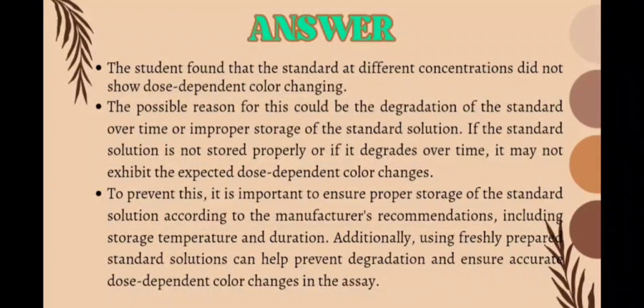So how can we prevent this from happening? Of course, to have proper storage conditions, it is very crucial to adhere to the manufacturer's recommendations for storing the standard solution. This includes the specific storage temperature and of course the duration. And of course, freshly prepared standard solutions also help to minimize the risk of degradation over time. And the last will be definitely ensuring accuracy.